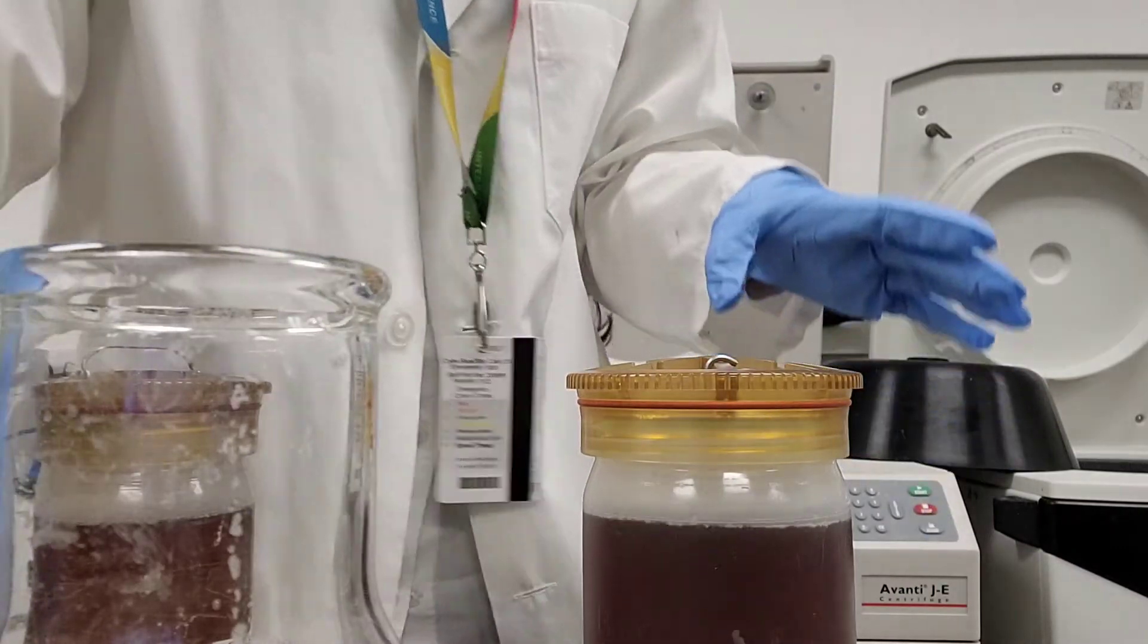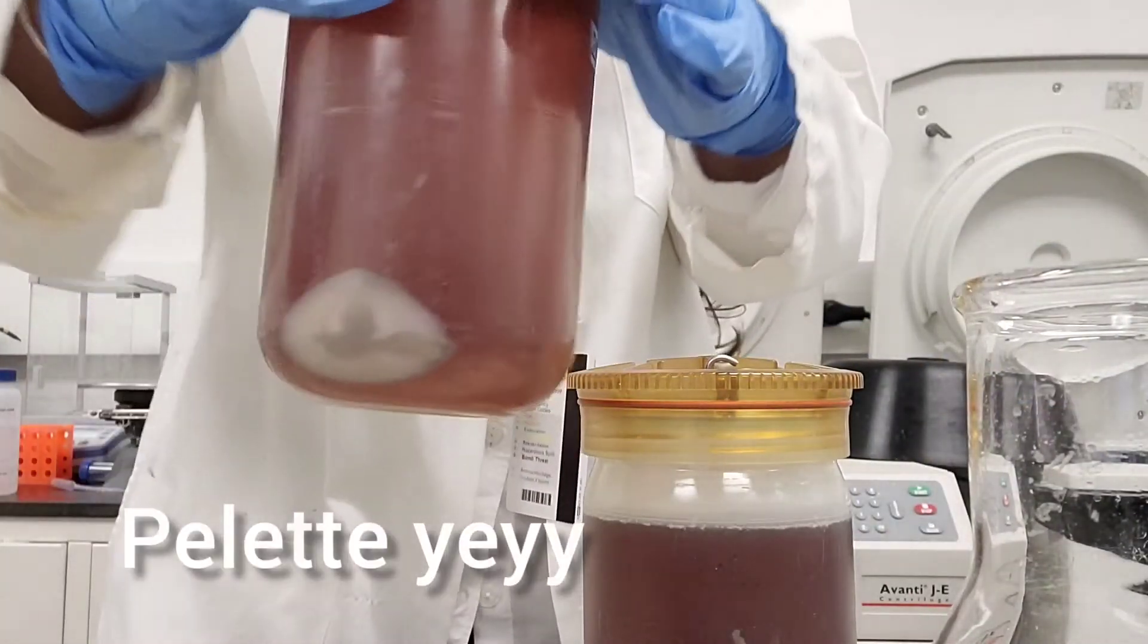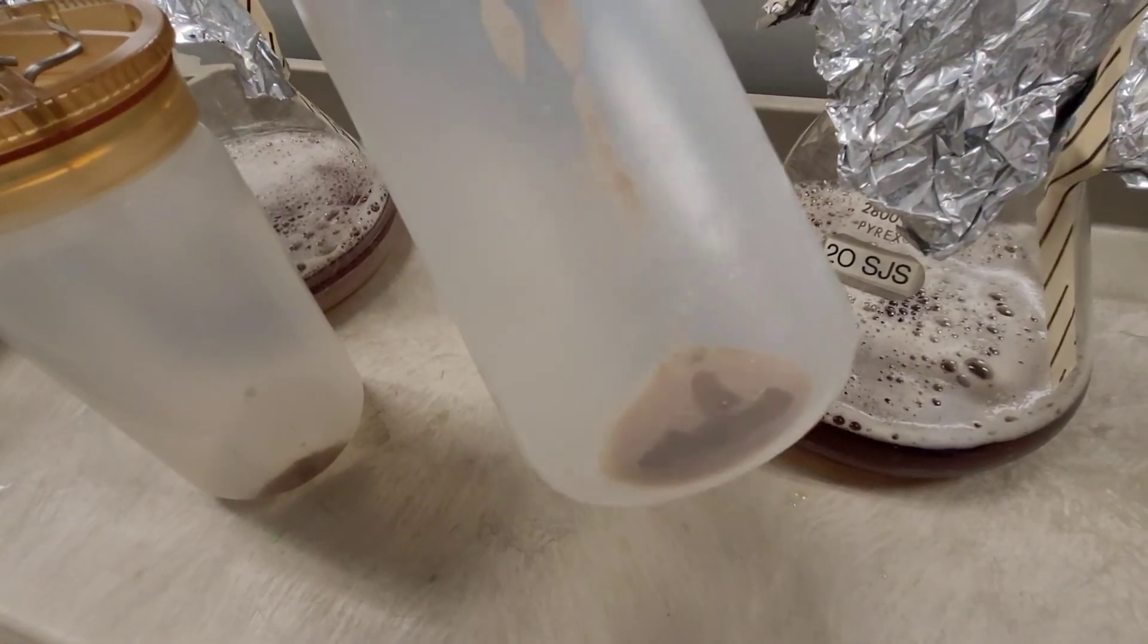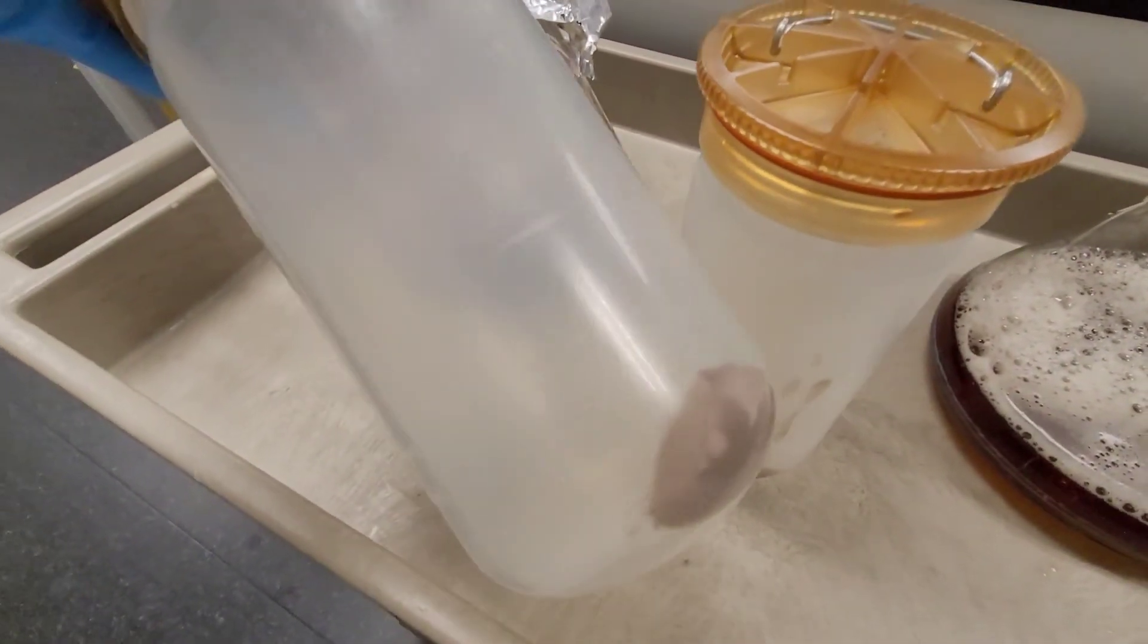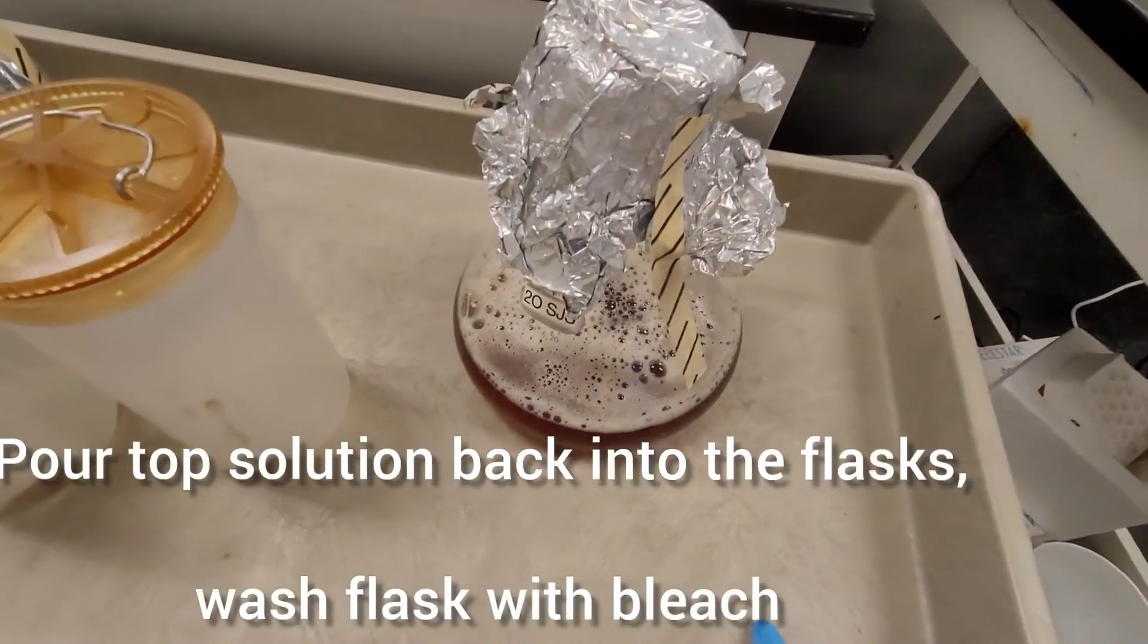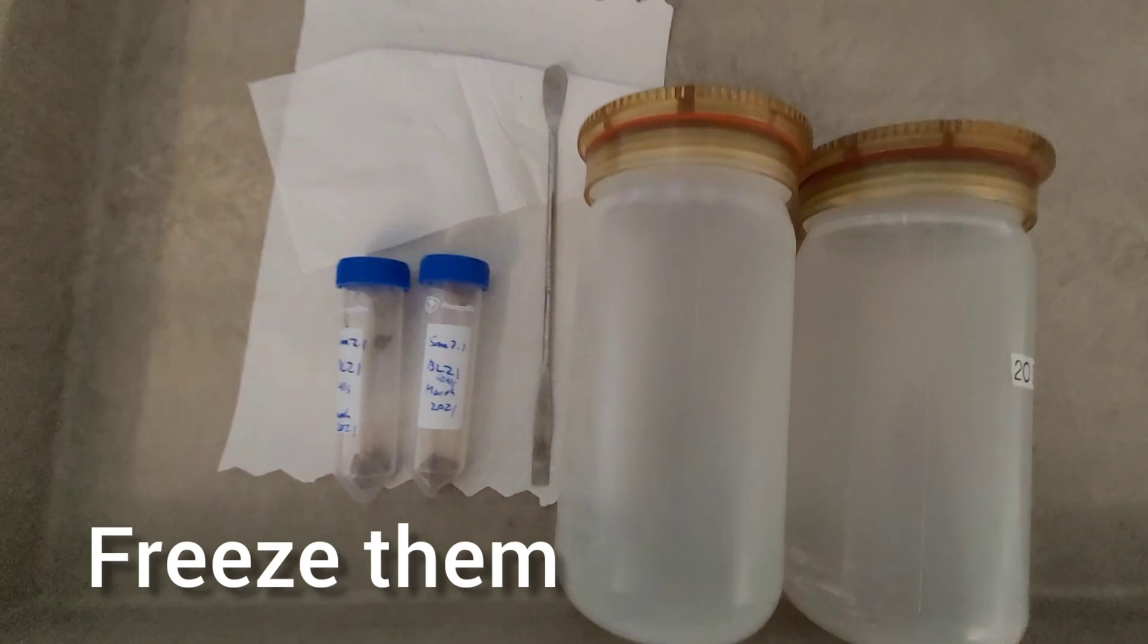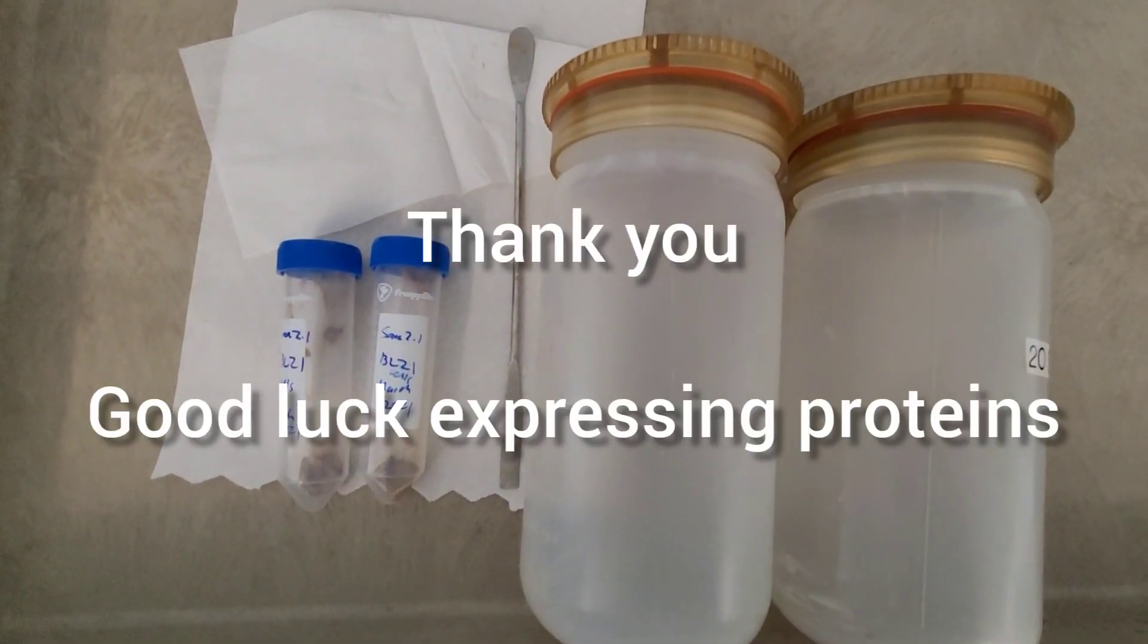Clearly you should be able to see your bacteria all collected as a pellet in the bottom, which is exactly what you want. Then you dump the supernatant or the top solution back into the one liter flasks. Then you want to transfer your pellet to tubes and put them in the freezer and clean everything with bleach and water. Thank you so much for watching and good luck expressing proteins.